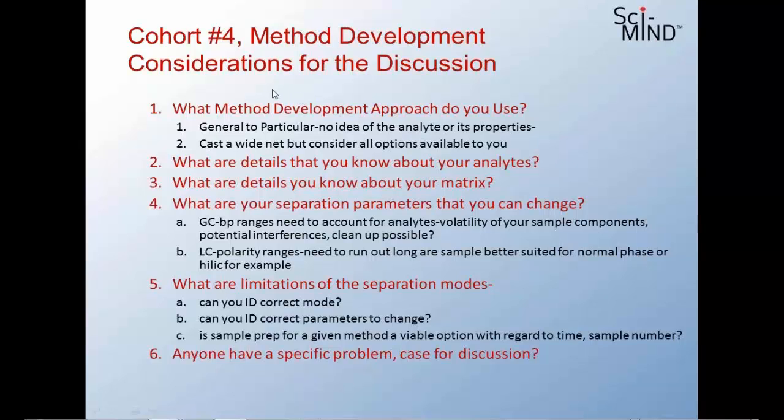Answering your question about SPME. Hello? Yes, you are asking if this would work with SPME, having a cold trap? Yes, it's done. Okay. Would it make it more efficient? Because I can imagine, if you're at the low boilers end, that would be a real problem if you had a larger range. Is it something that SPME could actually simplify? Well, I'm not sure about the large range because this is usually used for VOCs, but it is used especially if you want to capture low amounts of even benzene, for example. If you're doing a trace analysis, they use a cold trap to capture benzene. Okay. So it does help with higher sensitivity, even for benzene. Okay, that's great.